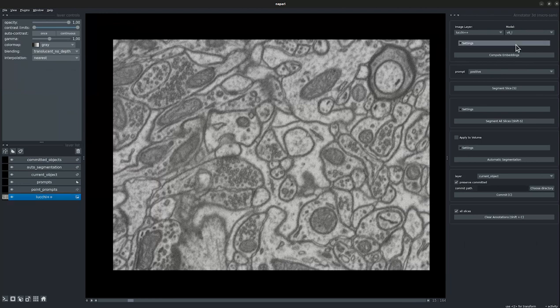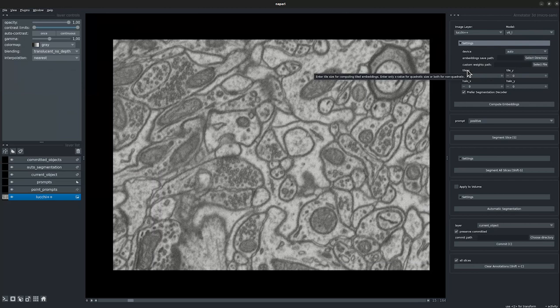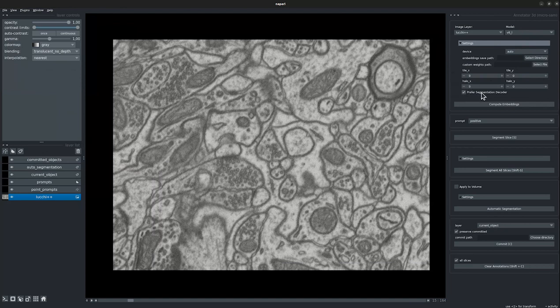There is the settings drop-down which opens the settings for computing the image embeddings. The next one is the drop-down for device, which chooses the PyTorch device for your computational resource. The next one is the embedding save path where the embeddings are stored or loaded from. The next one is the path to your custom weight checkpoints, where you can load custom fine-tuned checkpoints. The next one is the tiling window shape in X and Y dimensions, and the other is the overlapping window shape for the tiling operation in X and Y dimensions. The last option is if you prefer a segmentation decoder for the fine-tuned MicroSAM models.